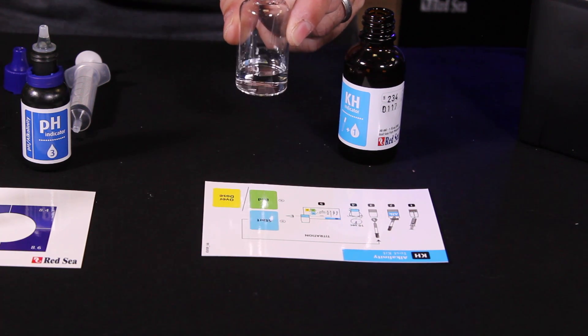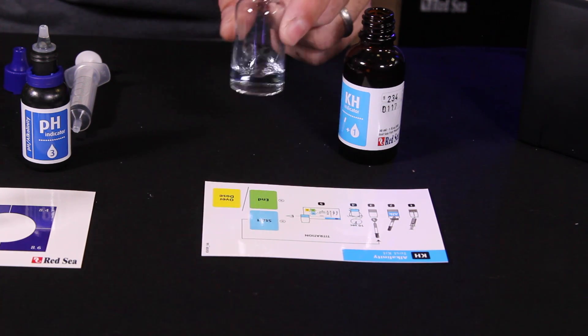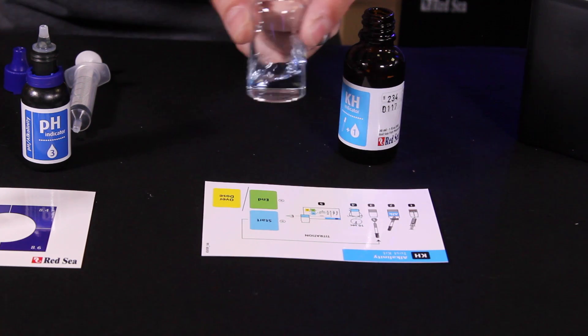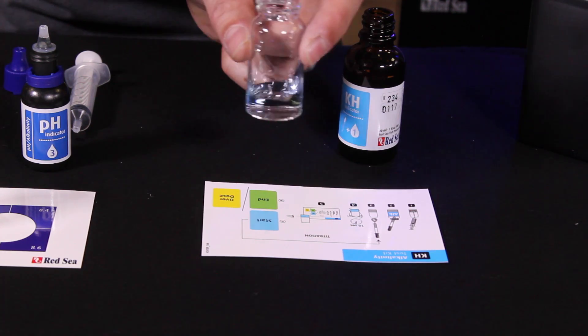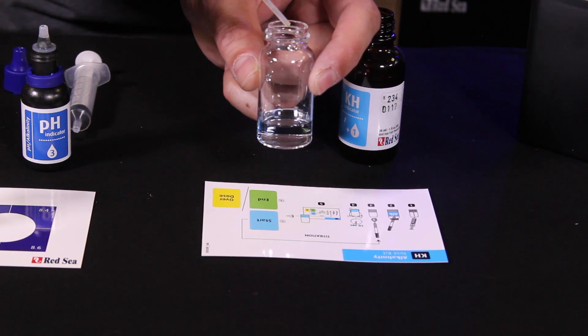Then we're going to swirl. And it helps to hold against the white background like this card so I can actually see the color. We're looking for a color change from blue to green.